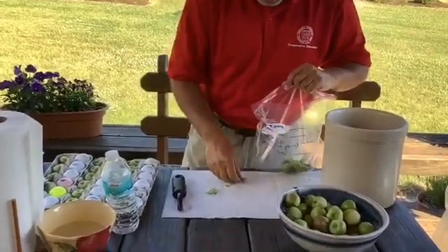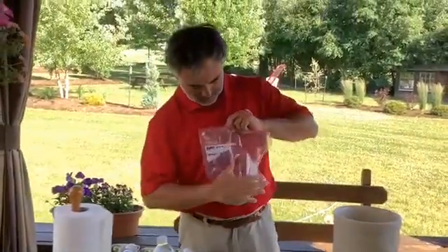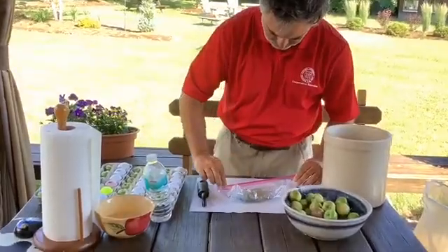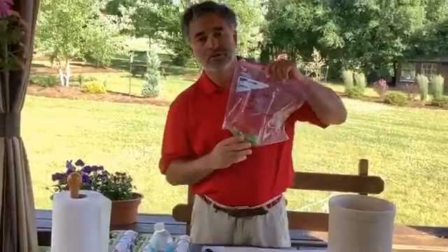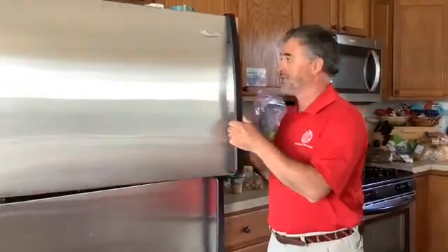You can use any kind of bag that you can place in your freezer. You put it there, you take out the air, and you zip it, and it's ready to go to the freezer. And the last step is to take your sample and put it right away in your freezer like I'm doing now.